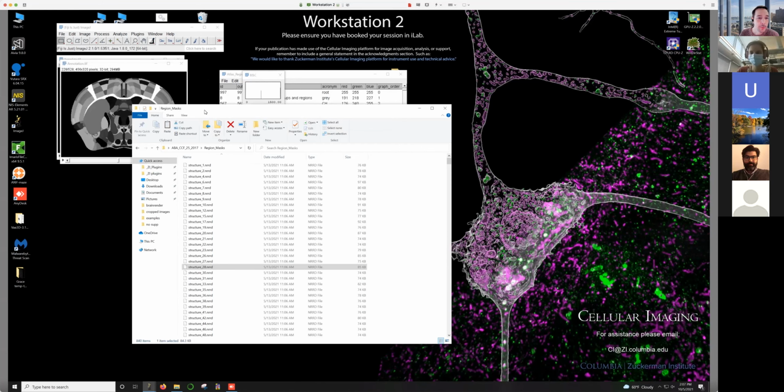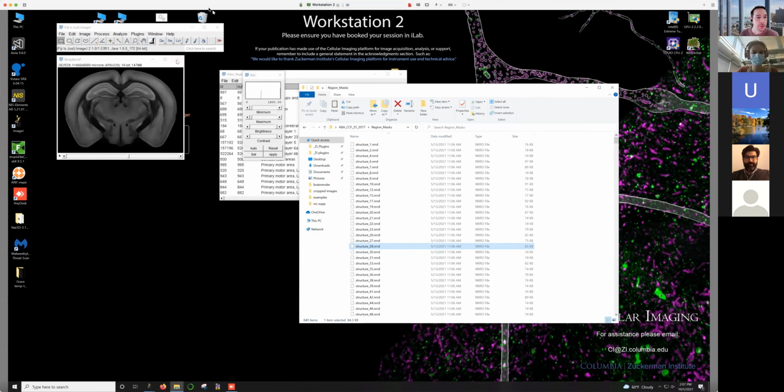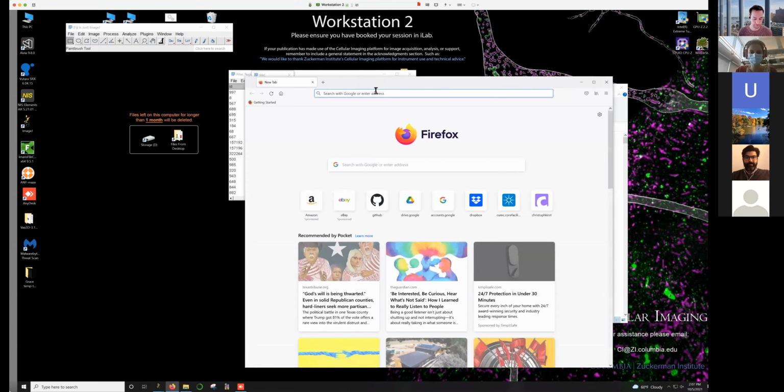But I wouldn't recommend doing that. The alternative is actually to use BrainRender. So to start with, I hope all of you have Anaconda already installed. That'll make it a little bit quicker. We need to create an environment for BrainRender, and then we also need to download BrainRender. So actually maybe just quickly, we can go to the website.